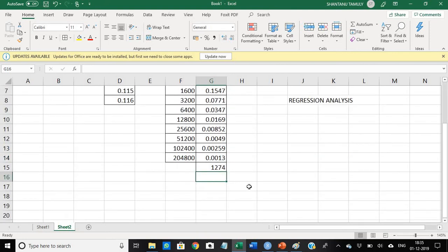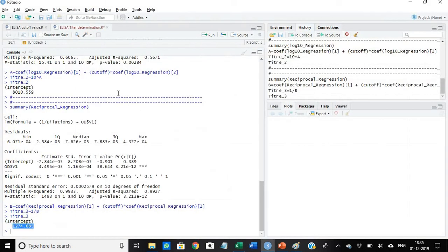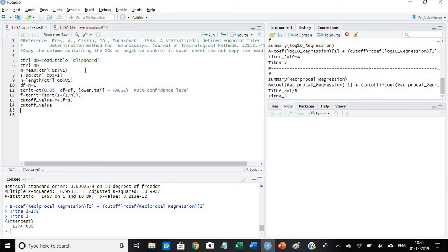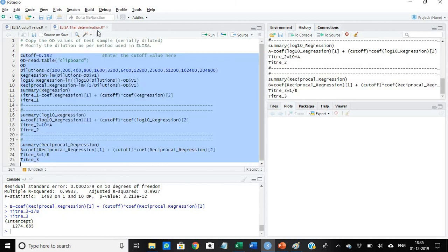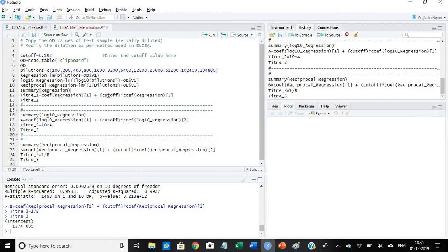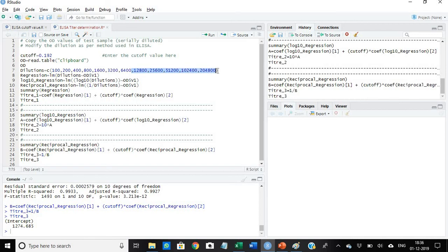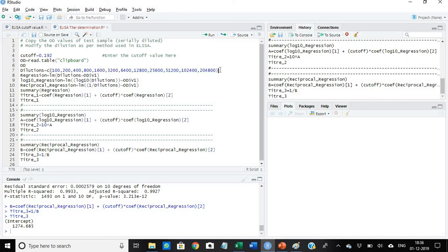Thank you very much for watching this. As far as our R scripts are concerned, these two R scripts I have developed: one is for ELISA cutoff value and this is for determination of ELISA titer. Now sometimes, if you look into this particular command, here I put the dilution from 100 to 204,800. If in your ELISA your dilution is less, in that case you can cut. Supposing that your dilution is up to 6,400 only, then all these things you can just delete. Else if you use the ELISA plate up to this point, up to 12th point, no problem, you can use it as such. Thank you very much for watching this video. If you have any question, you can put your question in the comment box. Thank you.